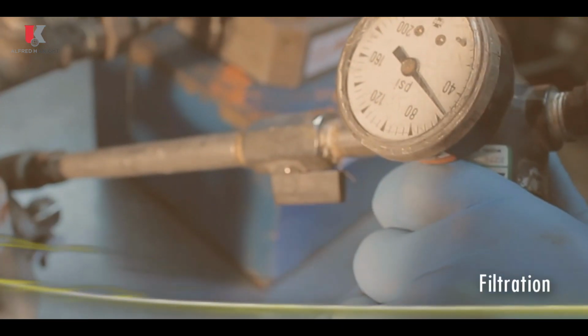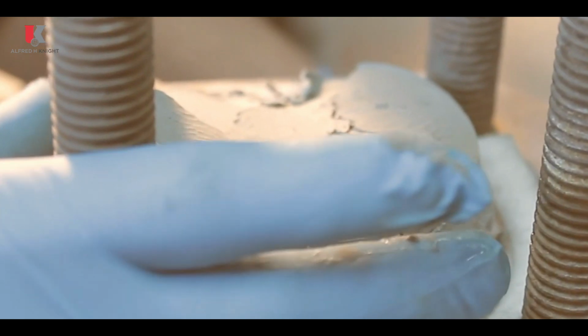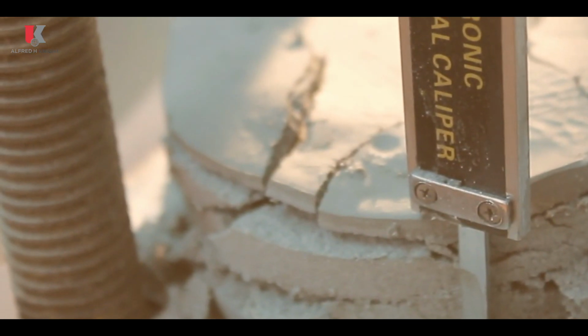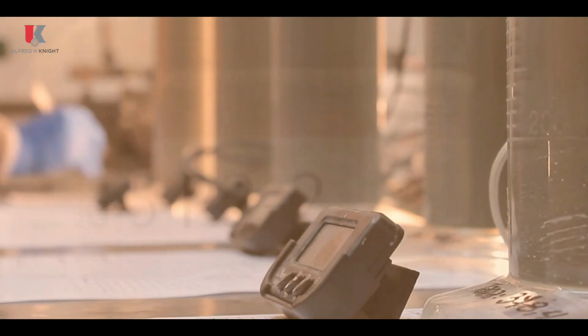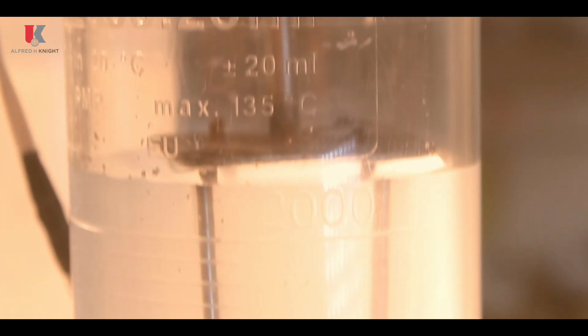Filtration. The objective is to obtain information for the sizing of filter presses. Filtration rate, filtering, washing and drying cycle times are measured, the thickness and humidity of the cake, the turbidity of the filtered water. Different operational parameters are tested for certain concentrate or tailings, such as solids concentration, fabric porosity, and filter aid.